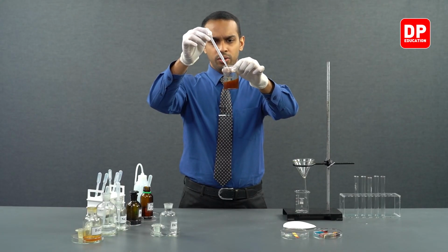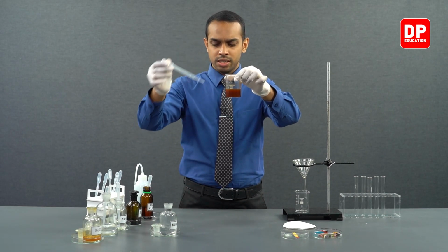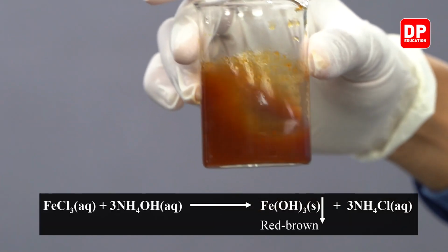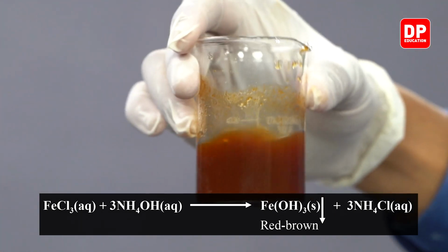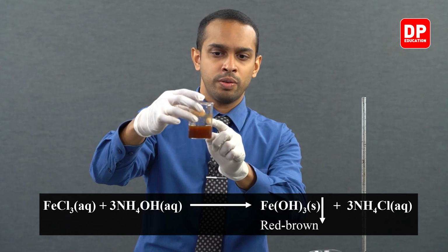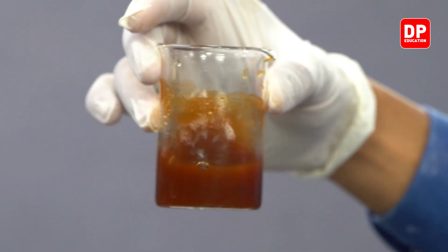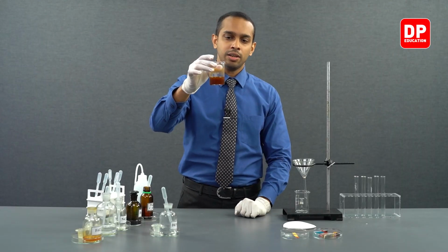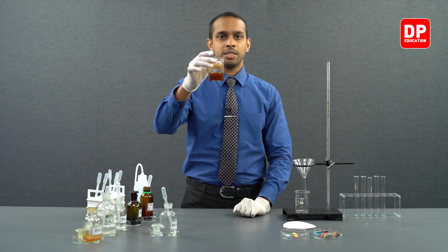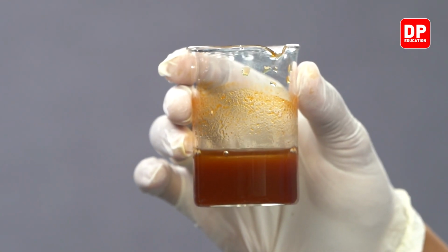As you can see, when we are adding dilute ammonia into this, the color of the solution starts to change, and you can see a brown color precipitate has started to form. You can see it coating the walls when I mix it, indicating that we have our brown color precipitate ferric hydroxide. So now let's filter the precipitate out from this suspension, and we'll obtain the supernatant of this suspension. The supernatant is going to be neutral ferric chloride solution.